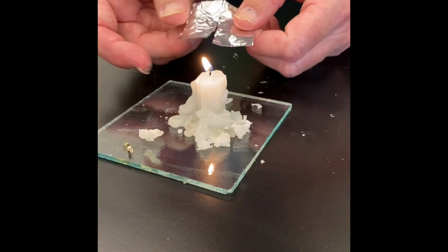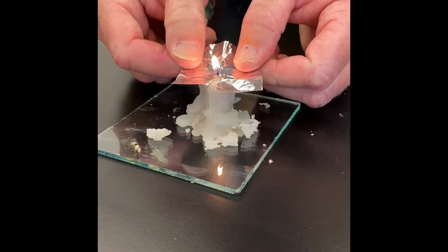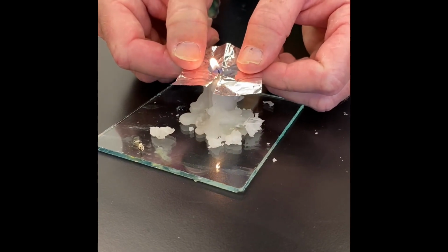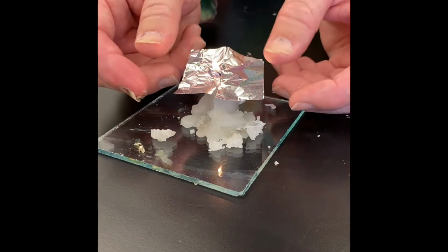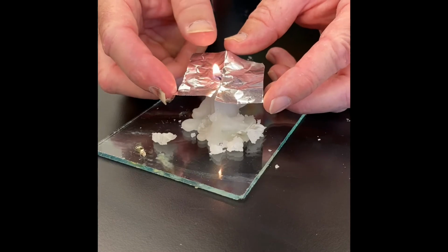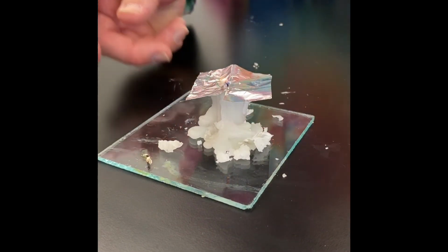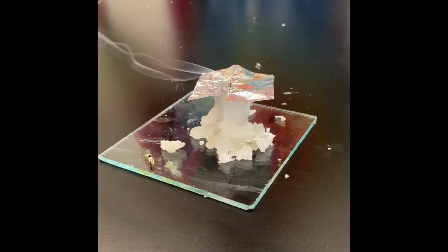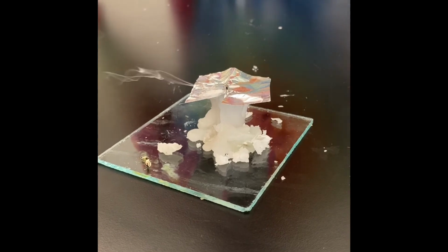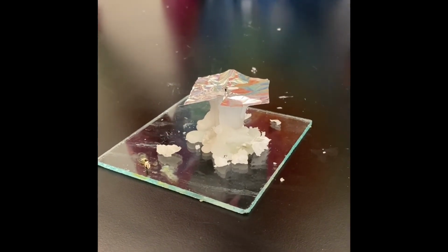Okay, I have my aluminum foil with the slit cut into it, and I am going to wrap it around the candle to create a barrier between the wax and the wick. And you could see what happens when we separate the wax from the burning candle wick part.